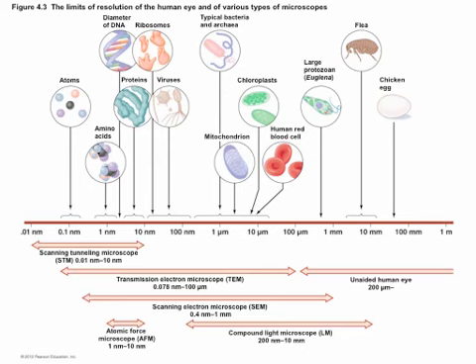TEM, transmission electron microscopy, has a little bit more resolving power than SEM, and tops out a little bit short as well, but covers basically the same range because you're using the same thing, electrons, to look at stuff.